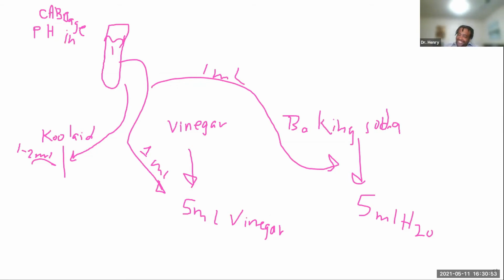Could you update the Canvas? Because I think you put the pH for the other one, but I don't see it on ours. Let me save it. Do you see it now? Yes, now I do. I remember Nate was saying his was kind of like a blood color. Mine's the same. Okay, that's fine.